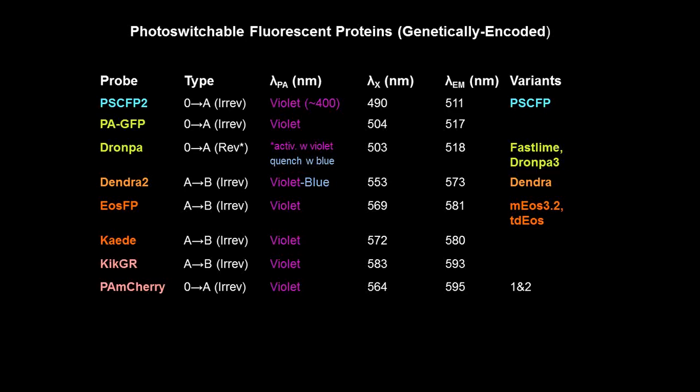So apart from that, you also have genetically encoded photoswitchable or photoactivatable proteins. The first one that kind of started it all was PA-GFP, the original seminal paper that was used for PALM and FPALM. And it's an okay protein. It's not very photon rich. So the best one that's available right now, if you wanted to try super resolution imaging, is Eos 3.2.